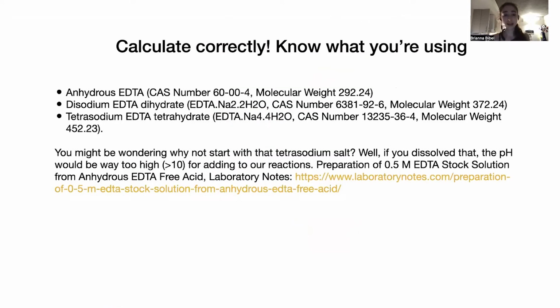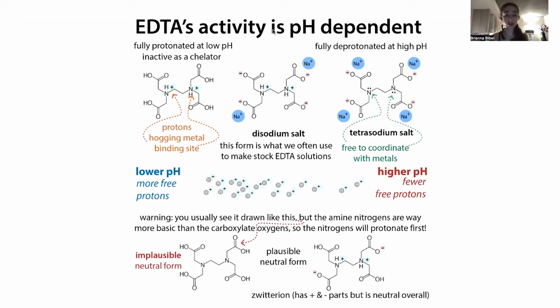Okay. And yeah, again, make sure that you know what you're using. There's also tetrasodium EDTA tetrahydrate. At first you might be like, okay, why don't I just use that? That would be the version of EDTA that is already totally deprotonated. So you think, oh, that'd be nice, then I don't have to add any NaOH, right?